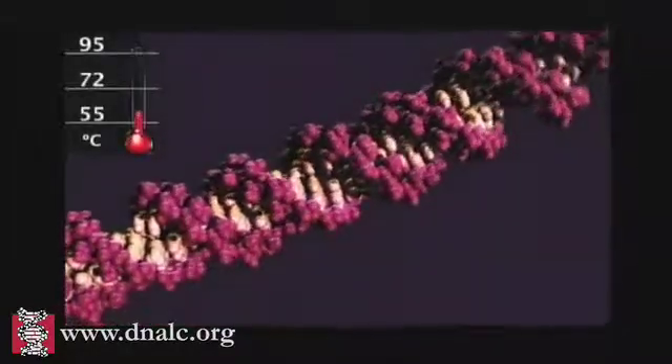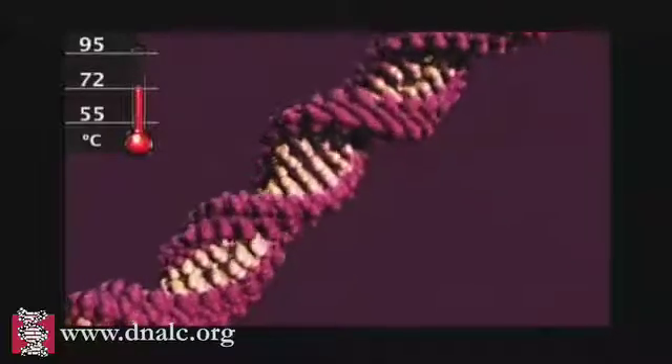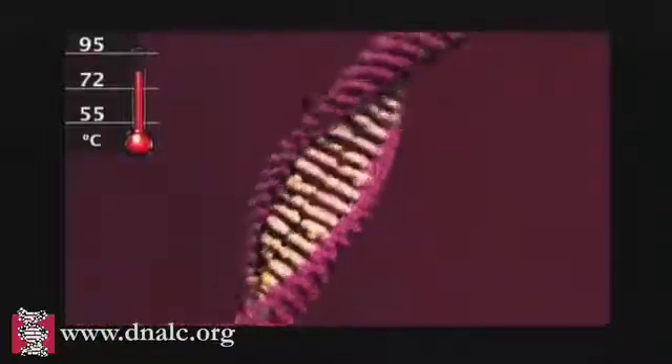Polymerase chain reaction, or PCR, uses repeated cycles of heating and cooling to make many copies of a specific region of DNA.